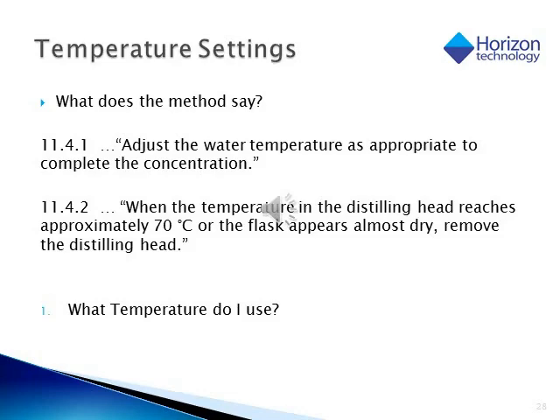Okay, now we've got to distill off the solvent. But what temperature do I use? In the past, Horizon Technology had a lot of users complain that their auditors were telling them they had to use 70 degrees C. By the time it looks dry, it's too late. What do I mean?